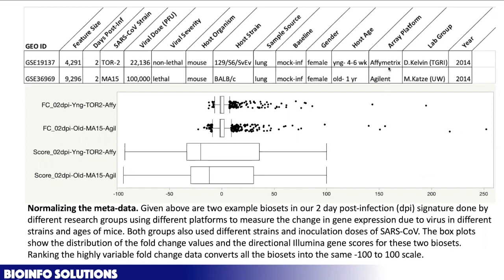I would say microarray expression. So these are all measuring hybridization. So what you've done is you create a template, you create different oligonucleotides specific to different areas on the mRNA. And then what you do is you put the RNA from your sample on it. It hybridizes to the correct spot. You wash all the non-specific binding out. And what you're left with is these hybridized things to these templates. And you basically label them with fluorescence.